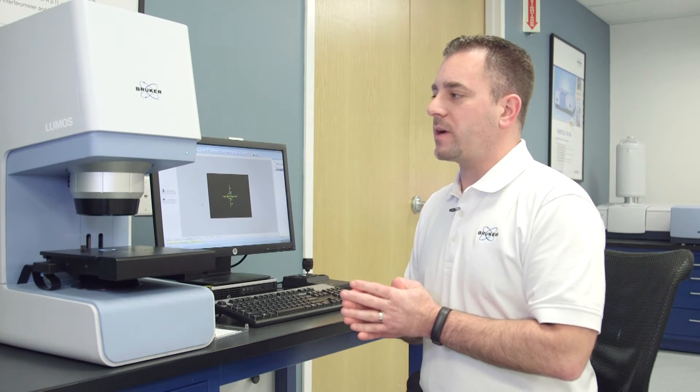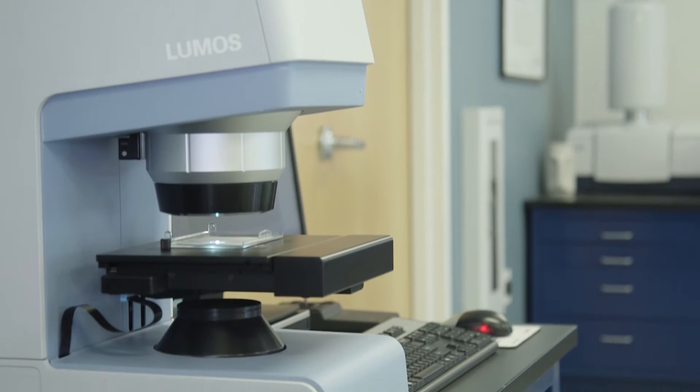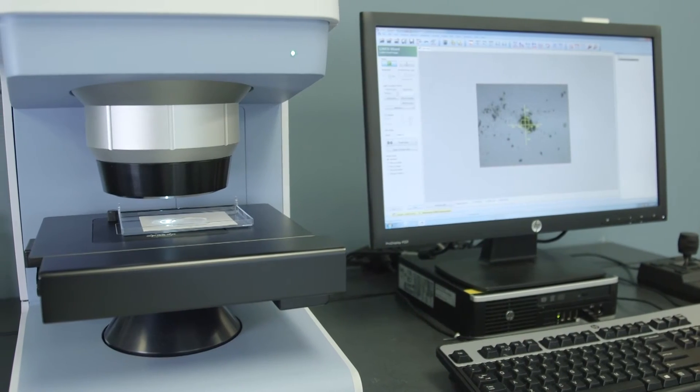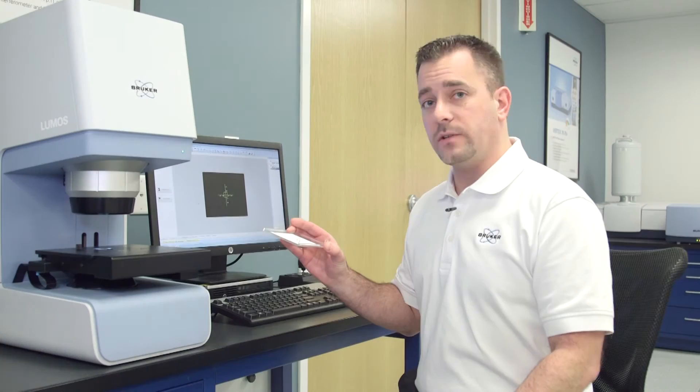Today I'm going to be focusing on our standalone FTIR Lumos Microscope. It is our most recent, most state-of-the-art FTIR microscope we've brought to market and specifically I'm going to focus on particulate analysis in the pharmaceutical industry.